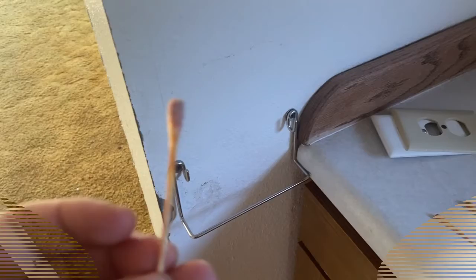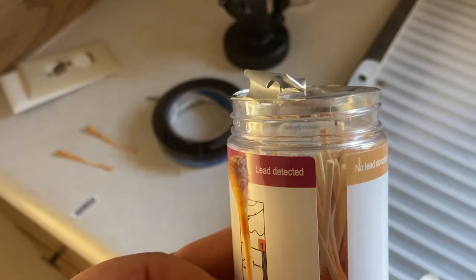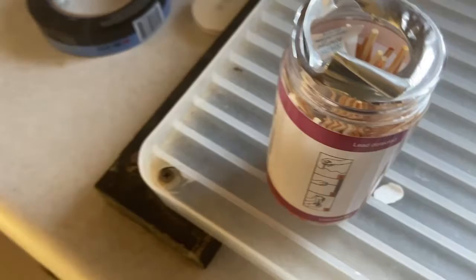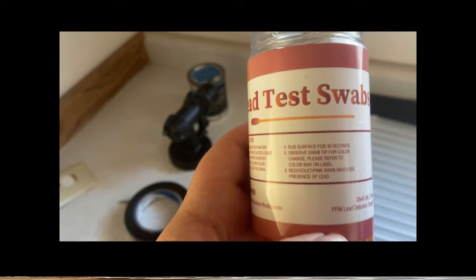This is that same swab you saw me do on that windowsill. I did another swab, set this one down, and came back to the kitchen. Now I kind of wonder if maybe there is some lead in there because that looks quite a bit darker where it collected. I did another windowsill and it's also pretty red right at that spot. The door jamb, which was clearly newer paint, is obviously the no lead detected. So I think I'm going to have to be careful about the windowsills.